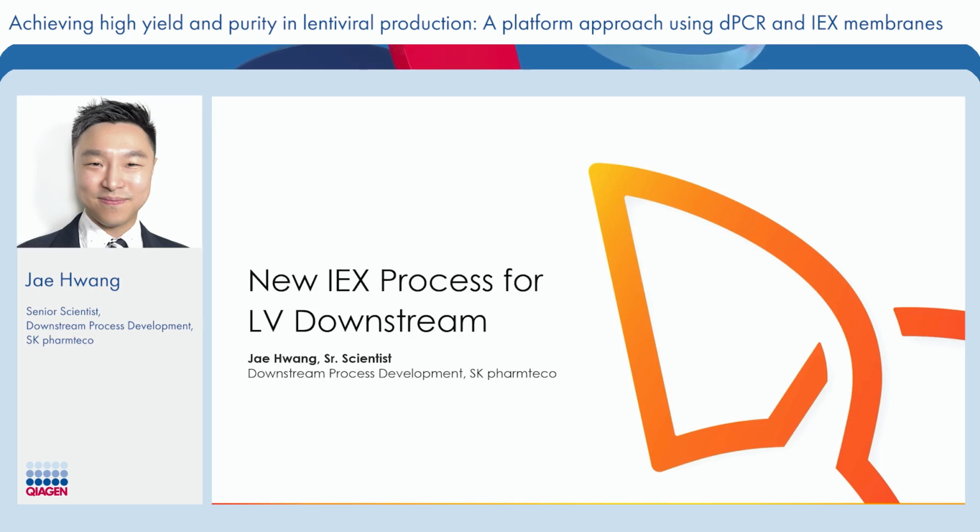Thank you, Oksana. Let's now turn our attention to the lentiviral vector downstream process. We'll begin by discussing some of the key challenges and opportunities we've identified in lentiviral vector downstream processing. Then I'll introduce our new IEX platform process before concluding with the impressive outcomes we've seen from successfully scaling this process from the benchtop all the way up to a larger 50-liter scale.